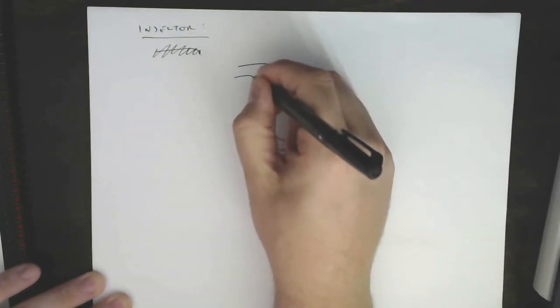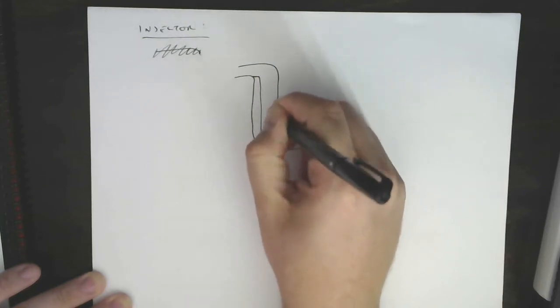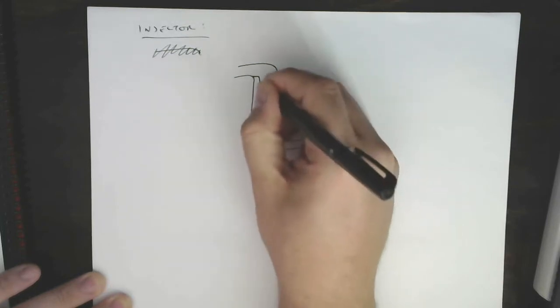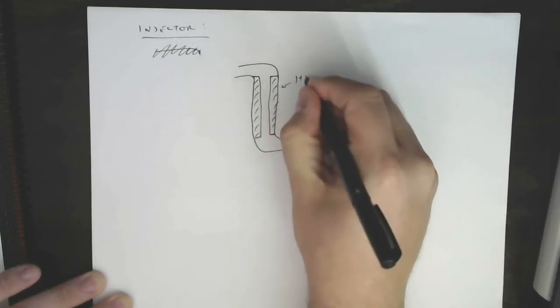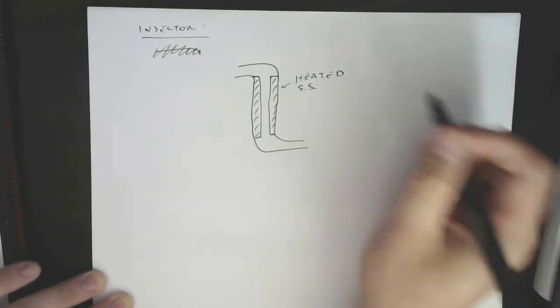That chamber is a stainless steel block, basically. So this is all stainless steel. This is a heated stainless steel block.